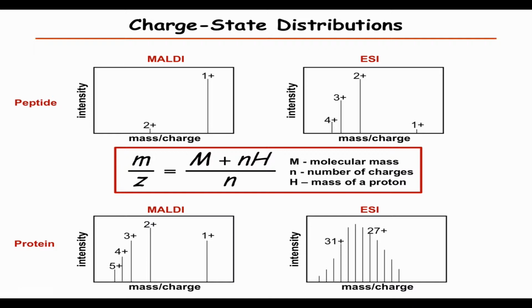Yeah, so in MALDI, what you do is you crystallize a small molecule, usually things like nicotinic acid, sinapinic acid, and they form a crystal. But you have a mixture of your proteins and peptides, so the peptides and proteins get embedded into this crystal, and then you shine a laser on it, and the laser deposits lots of energy. The matrix molecules are chosen so that they absorb the laser light at that wavelength.